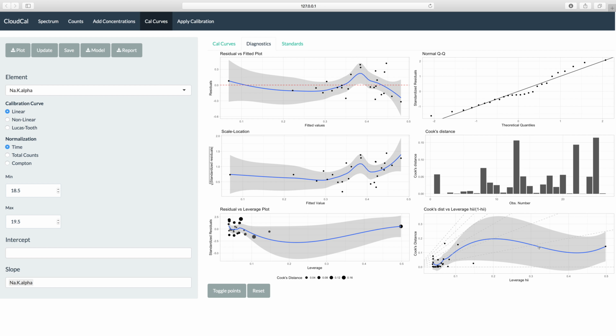An outlier is fine if it really represents a real measurement. But as anyone who's worked with ICP-MS or neutron activation analysis or any other quantitative chemical approach knows, we can have problems that get passed on to the elements. So you shouldn't take it for granted that all your elements will be correct. And that's really what the Cook's distance plot is for.